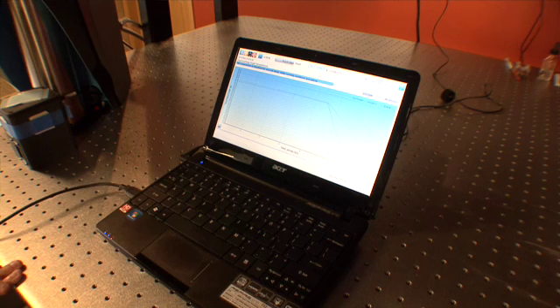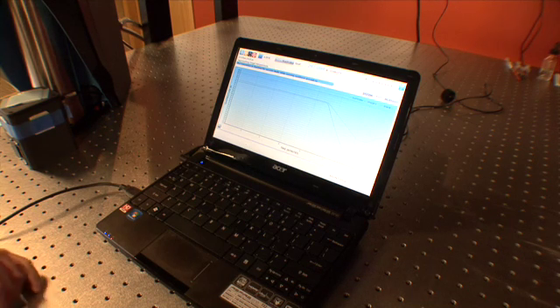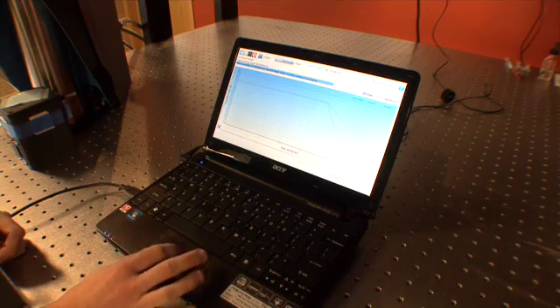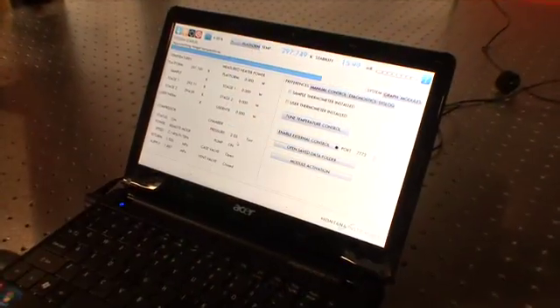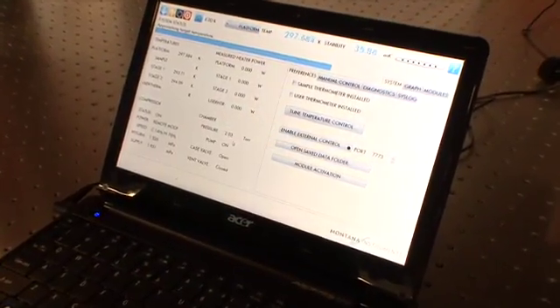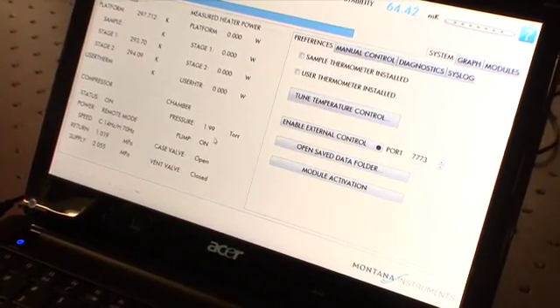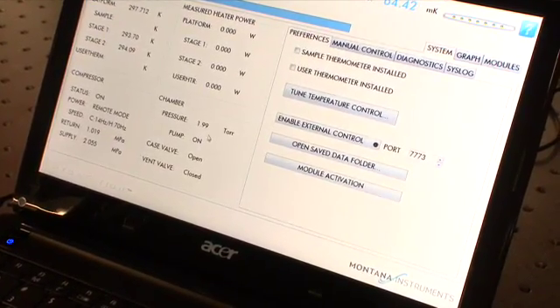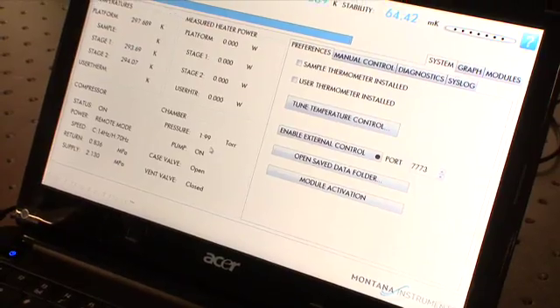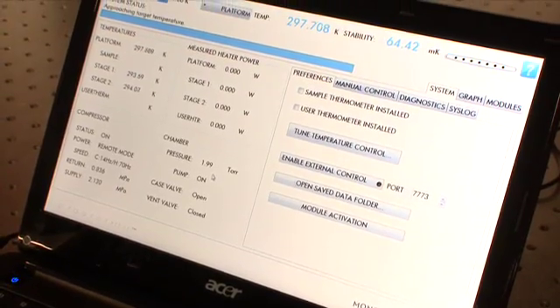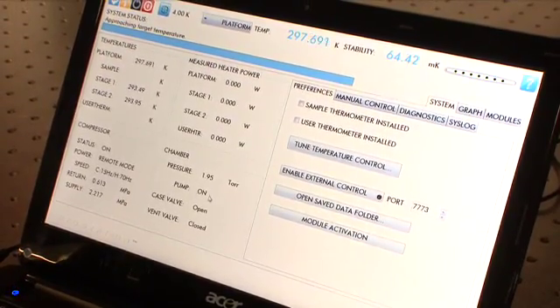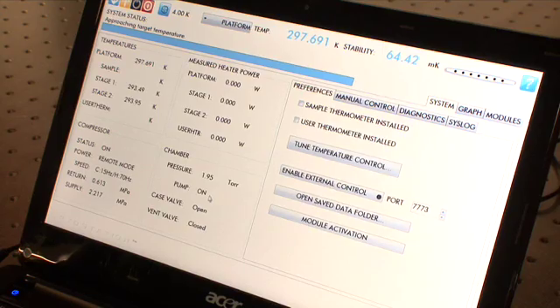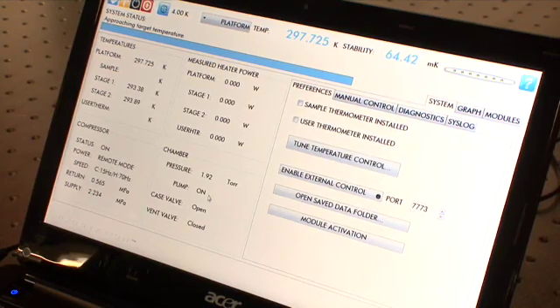At this point the pressure begins to drop, and in three to five minutes the pressure will reach 2 torr. Once you get to 2 torr, the compressor will begin to turn on. You can monitor the pressure in the system tab under the chamber.